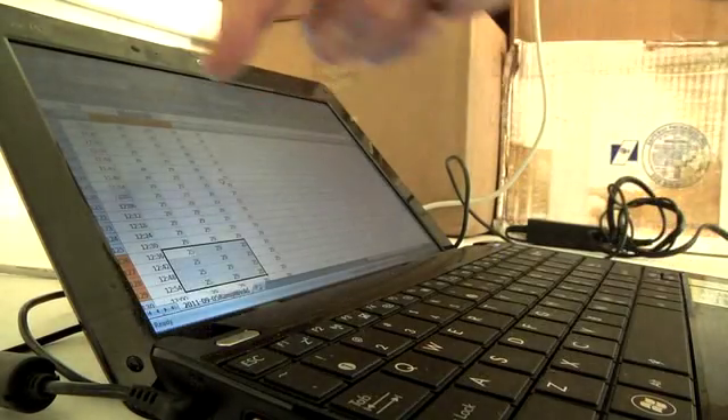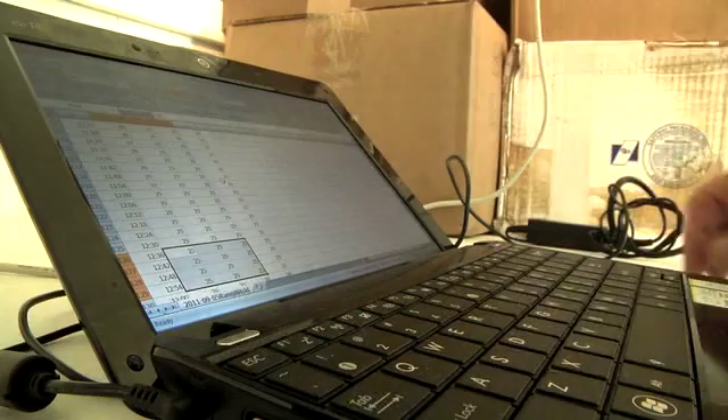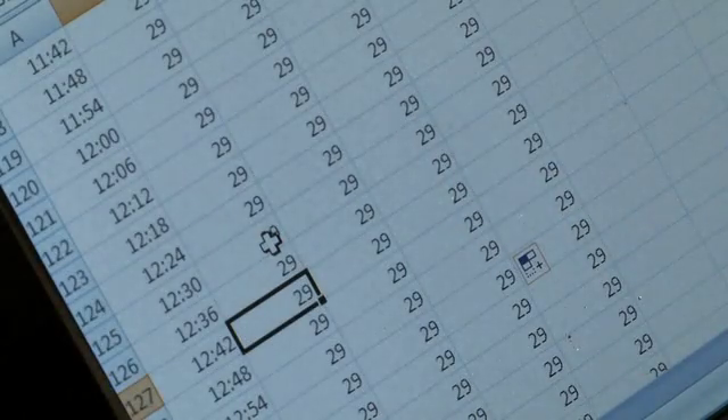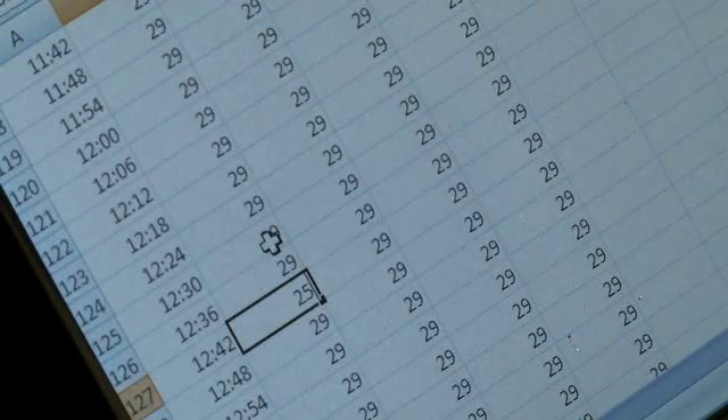The last piece of equipment is this netbook that controls the temperature of the tanks. This is the temperature for tank one, two, three, and four. If we want to change that temperature, we just put in different values and the machine will update the temperature for each tank.